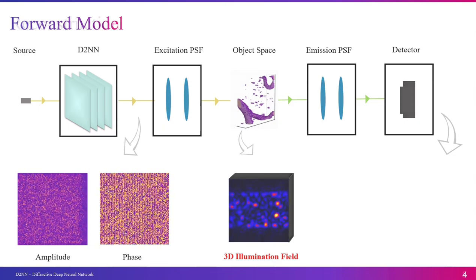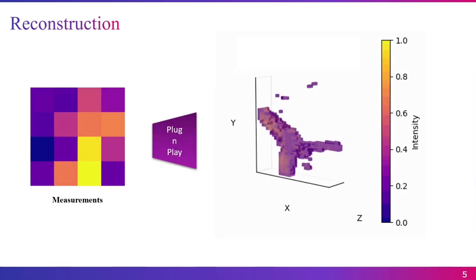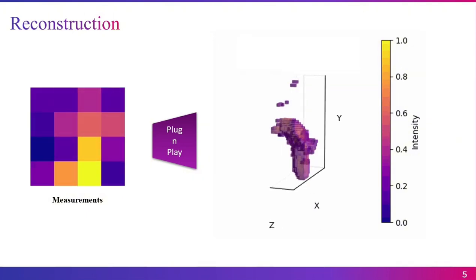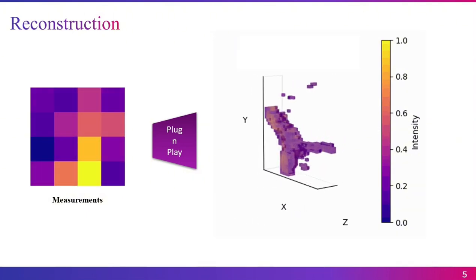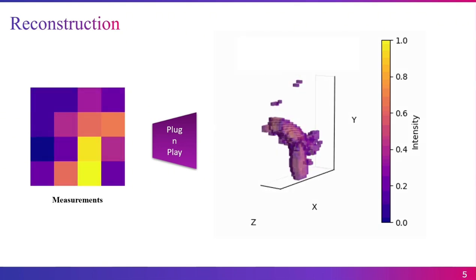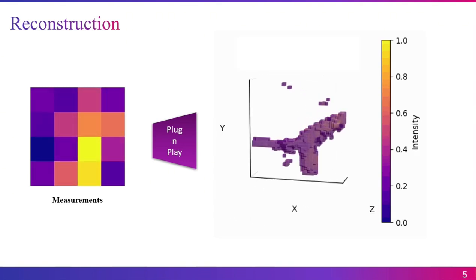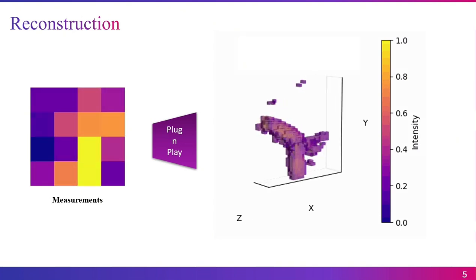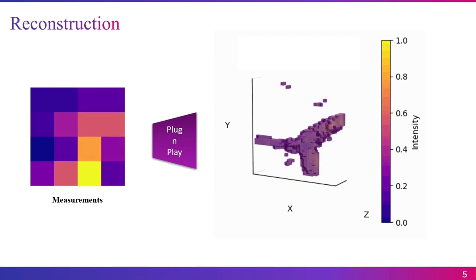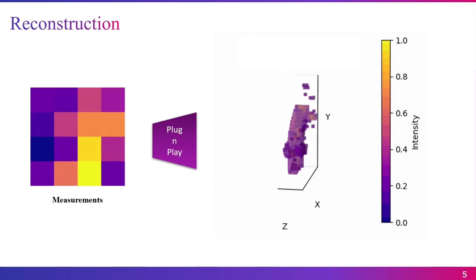The reconstruction problem entails estimating the original 3D specimen from a series of measurements with knowledge about the forward process. While the imaging simulation occurs at a finer sample level, reconstructing the specimen at such a high resolution poses challenges due to physical limitations. So we set our target as a low resolution object formed by 3D average pooling of the analog volume. Additionally, the forward process is approximated to match the digital volume via the proposed model approximation strategy.